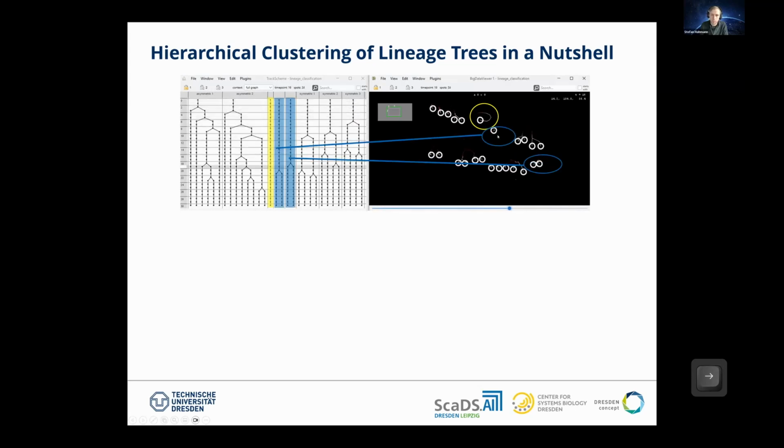And then there's, for example, these cells in the blue circle, and you can see in the track scheme that they have one division, and that's it. And you can also see that in the movie. They start with one cell, then they have one division. The same here. There's one cell, and then there's one division.